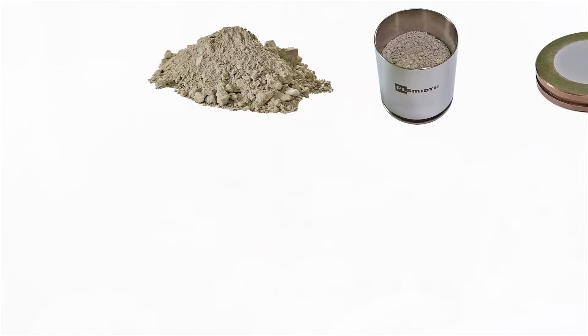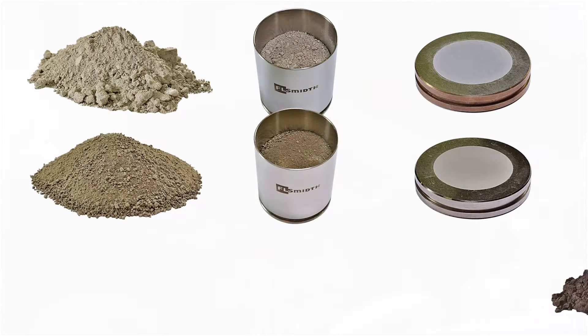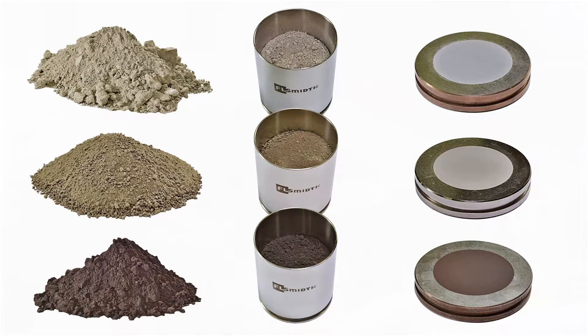Designed to meet the most stringent laboratory quality control procedures, the Centaurus V2 maximizes sample preparation efficiency while reducing common issues such as cross-contamination and operator-induced variation.